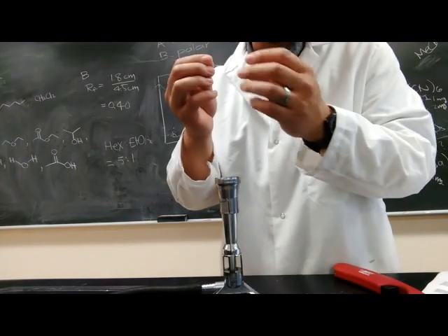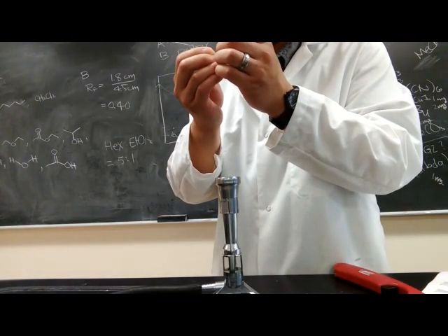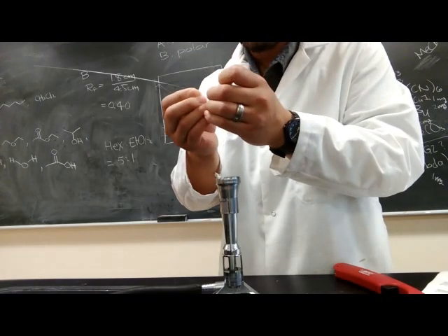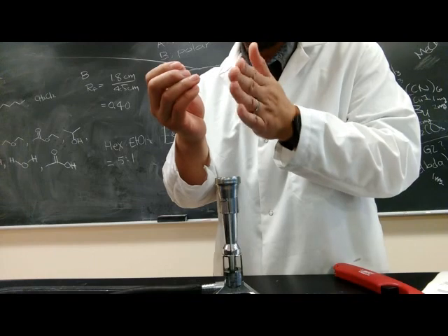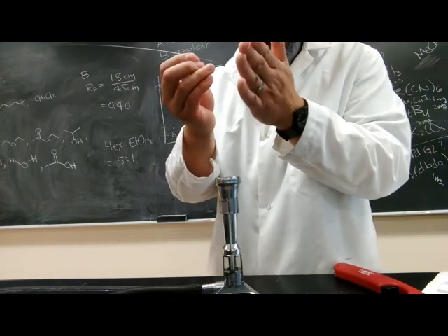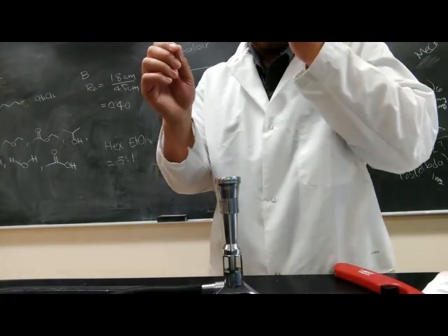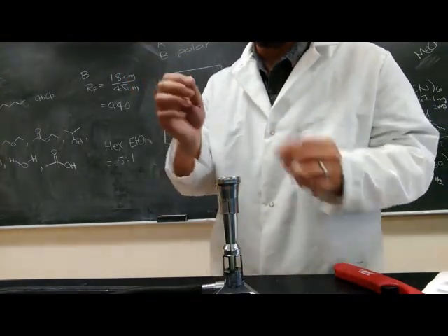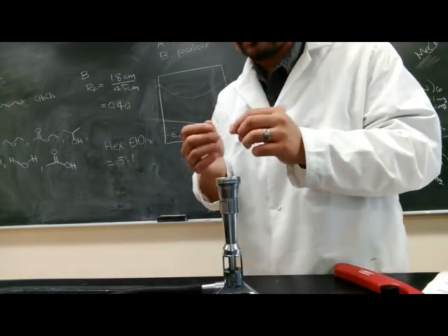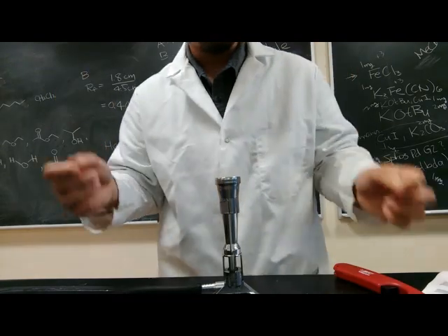Now when you break the capillary with your fingers, you will want to make sure that the end of the capillary is broken in such a way that it's really flat, because if it has a slanted angle, it's really difficult to spot your sample solution onto the TLC plate. It needs to be flat for the solution to come out onto the TLC plate. So this is how you make your capillary. Be careful with the flame, please.